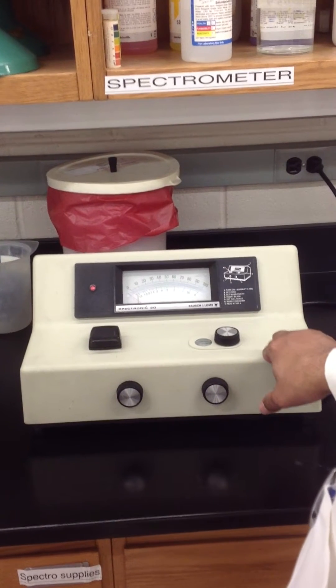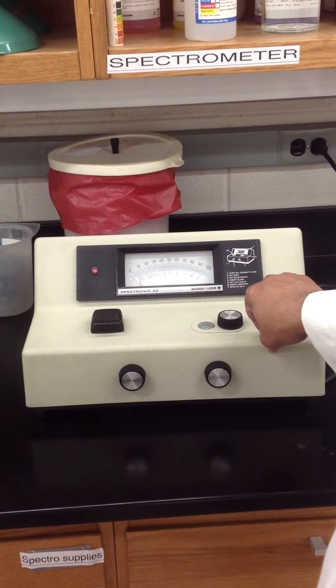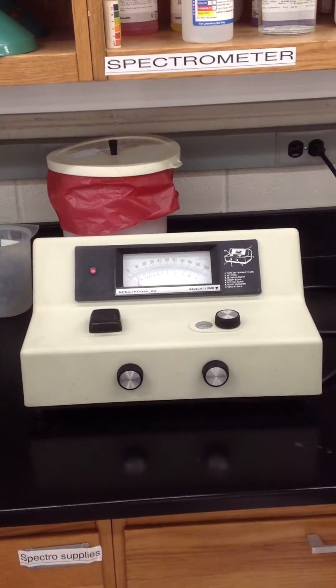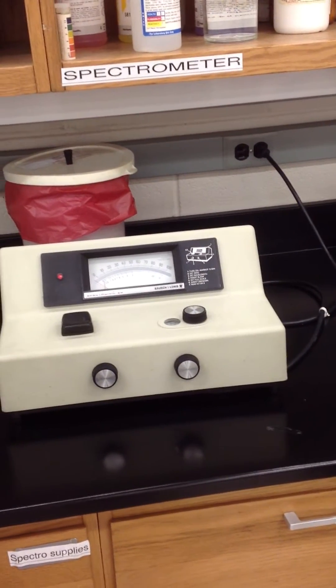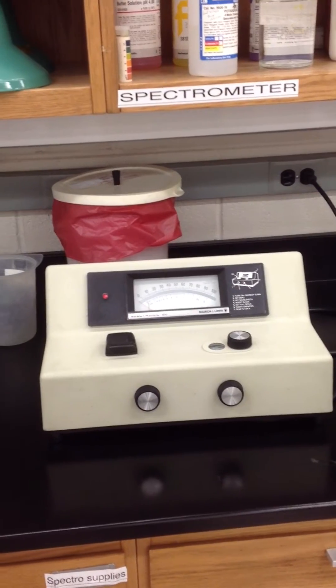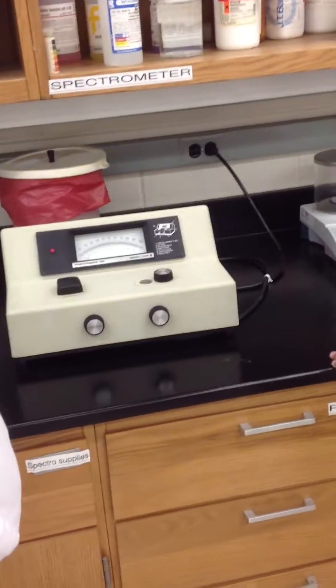You need a blank or a zero tube. That's why we did the zero concentration. So whatever you use to do your dilutions, whatever solution, here we're using Drapkins. So your zero or your blank tube will be Drapkins. That's what we're using to mix.